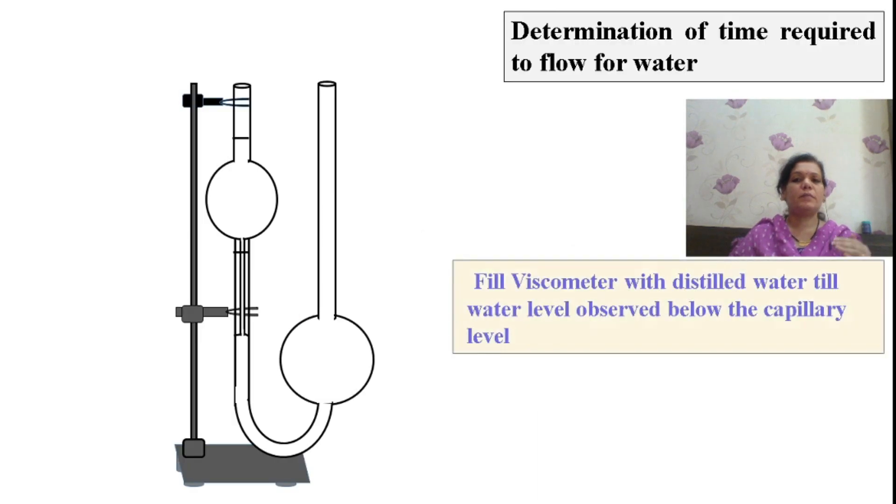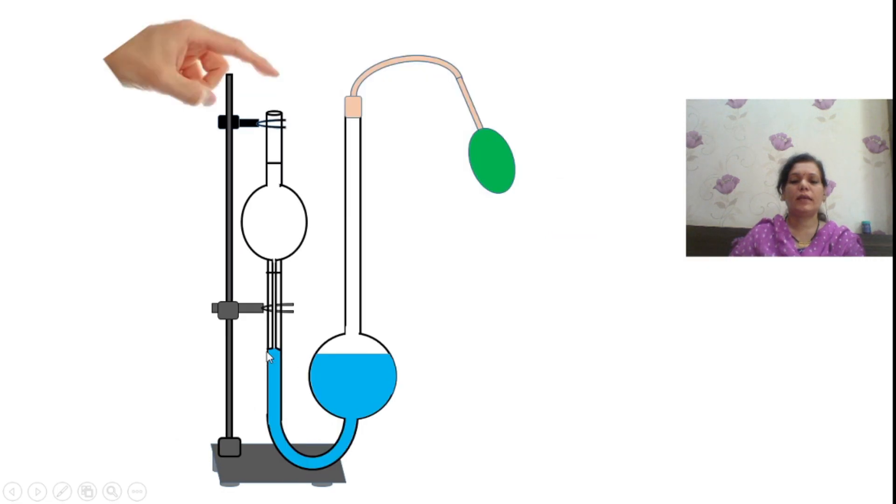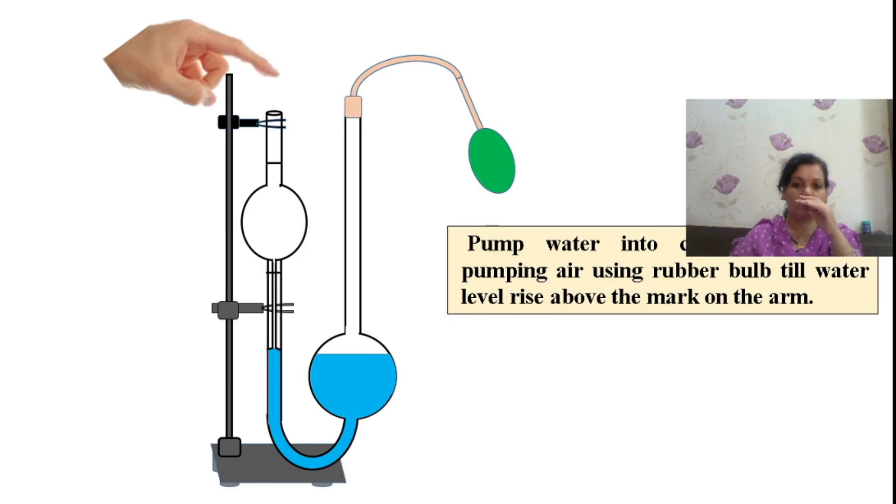Then determine the time of flow of water. Pass the water from this side. Take care that you are not filling much amount, only 20 ml and not moving above this capillary level. We will carry out the experiment with the help of pumping this rubber bulb. We pump the air through this rubber bulb. As the air moves inside, the liquid will transfer from this level, it will move ahead and go up to this mark.